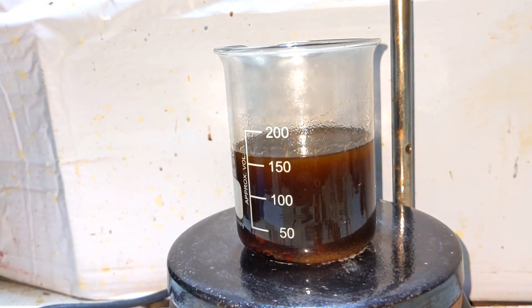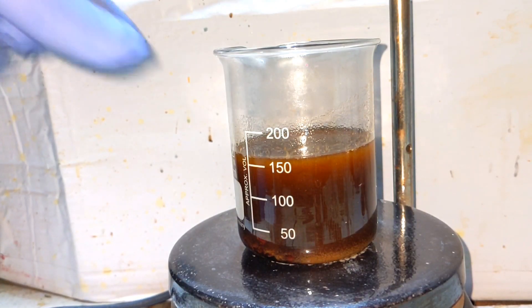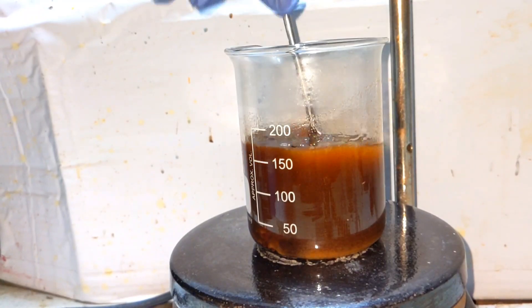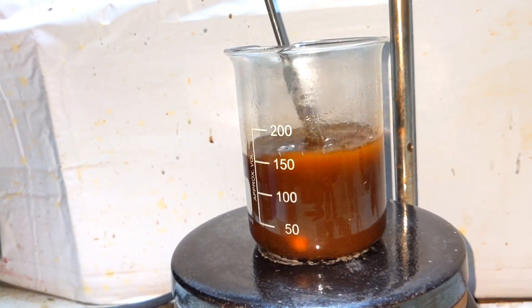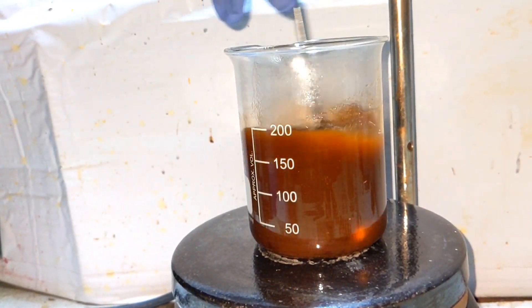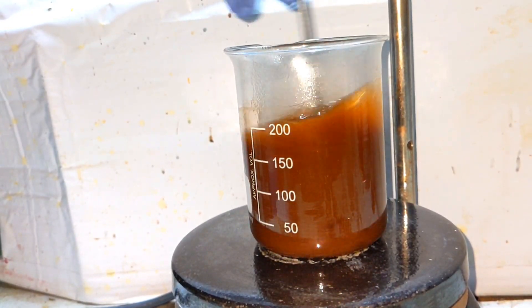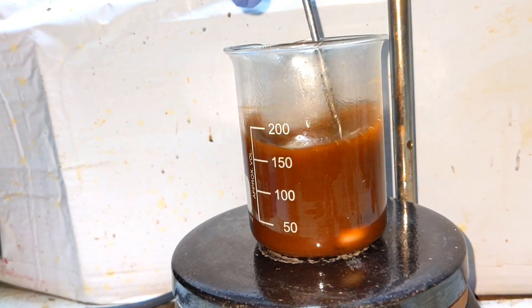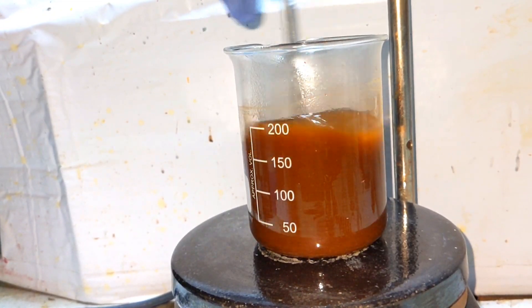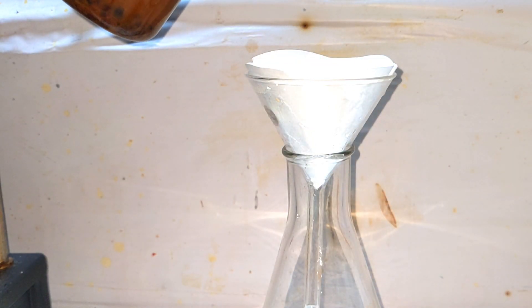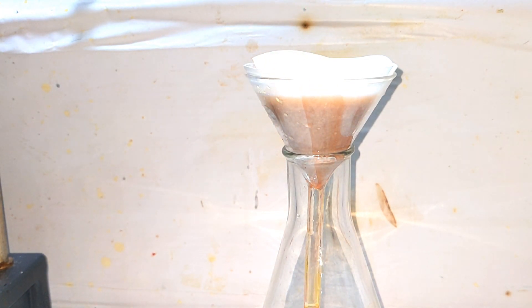This will cause the complex to precipitate out of the solution. I am using a spatula to stir it up because my magnetic stirring bar got stuck inside the precipitate. You can see the nice orange color of the compound. Now we filter the solution using a simple gravity filtration method.